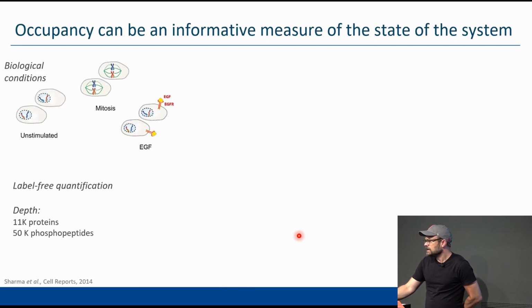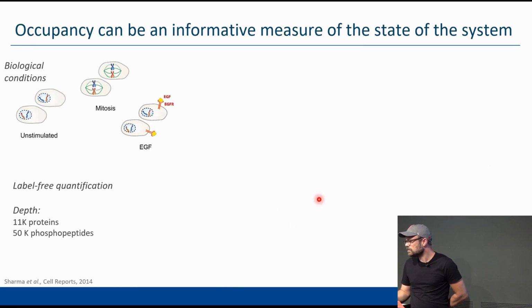In this paper from Kirti, who was a plenary speaker from 14, sorry, everything was presented and benchmarked using HeLa S3 cells.